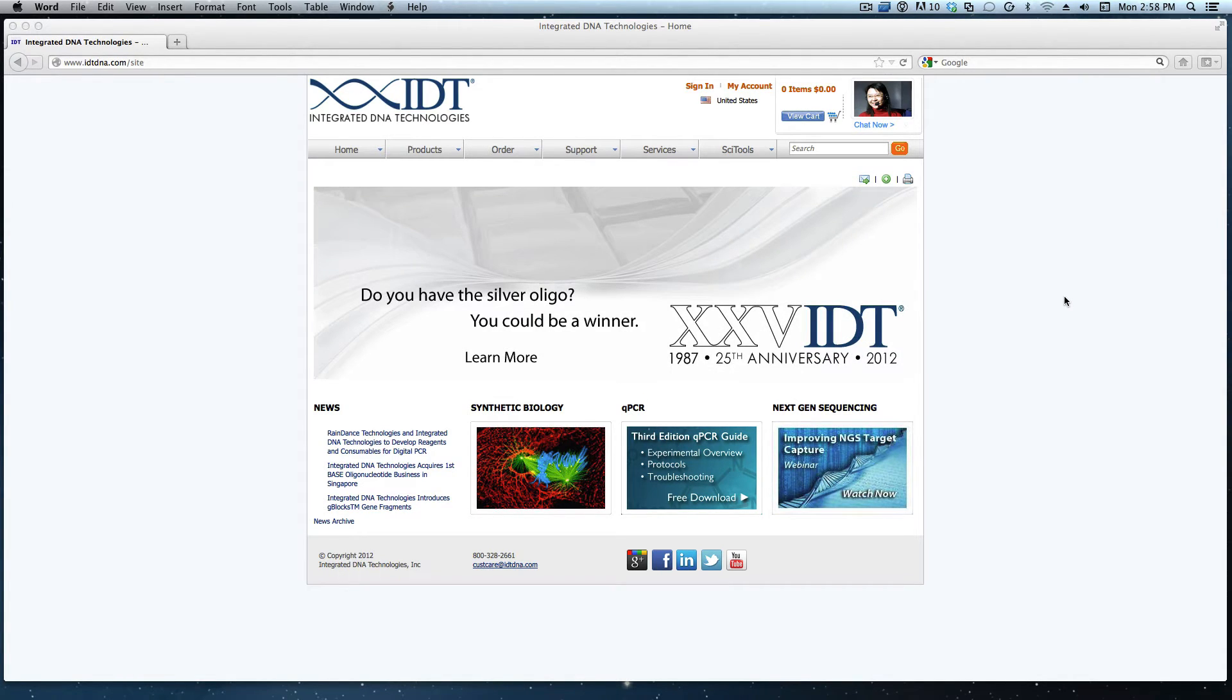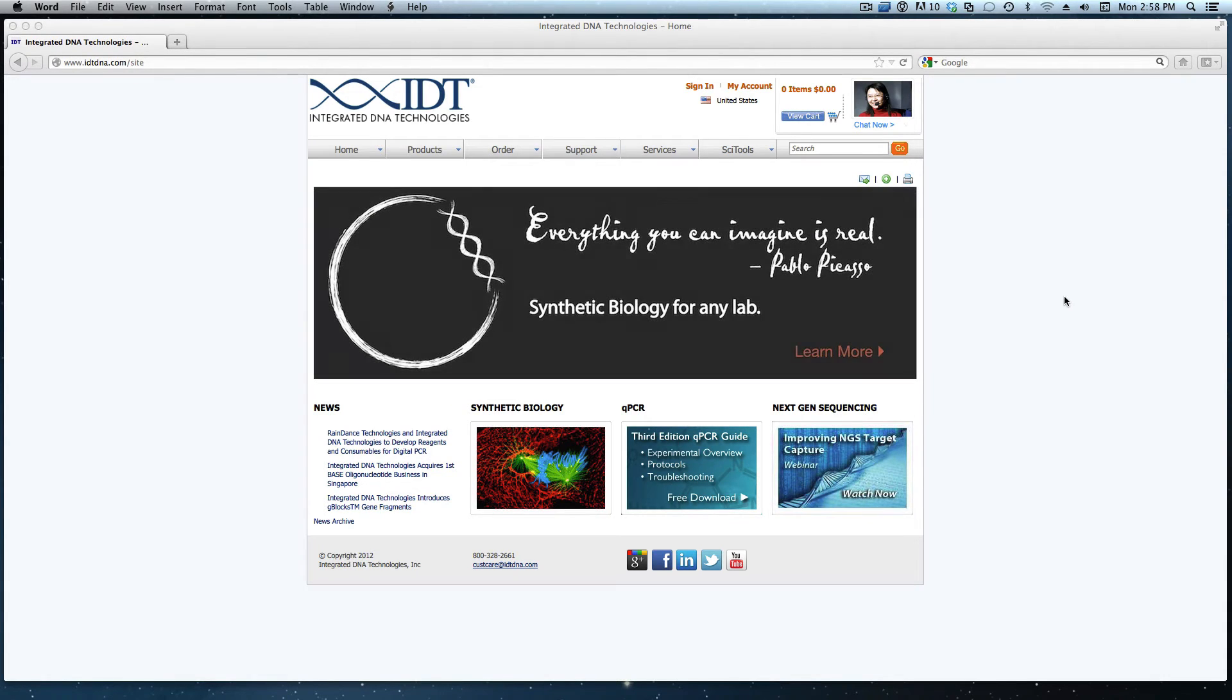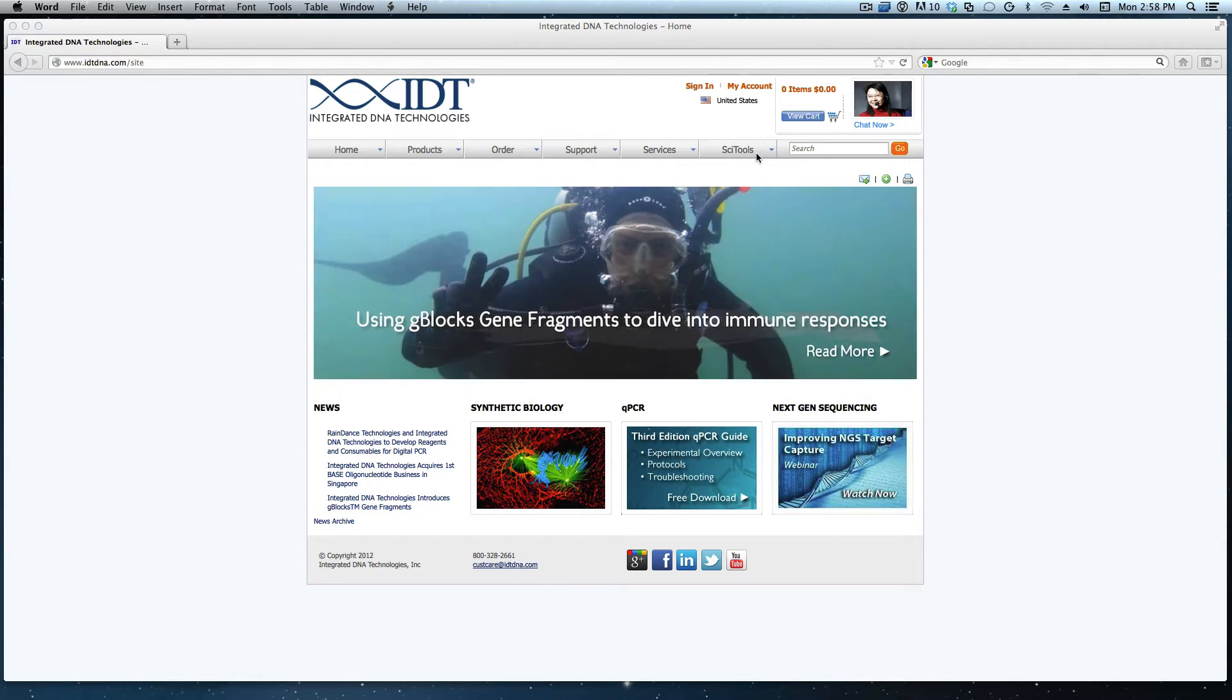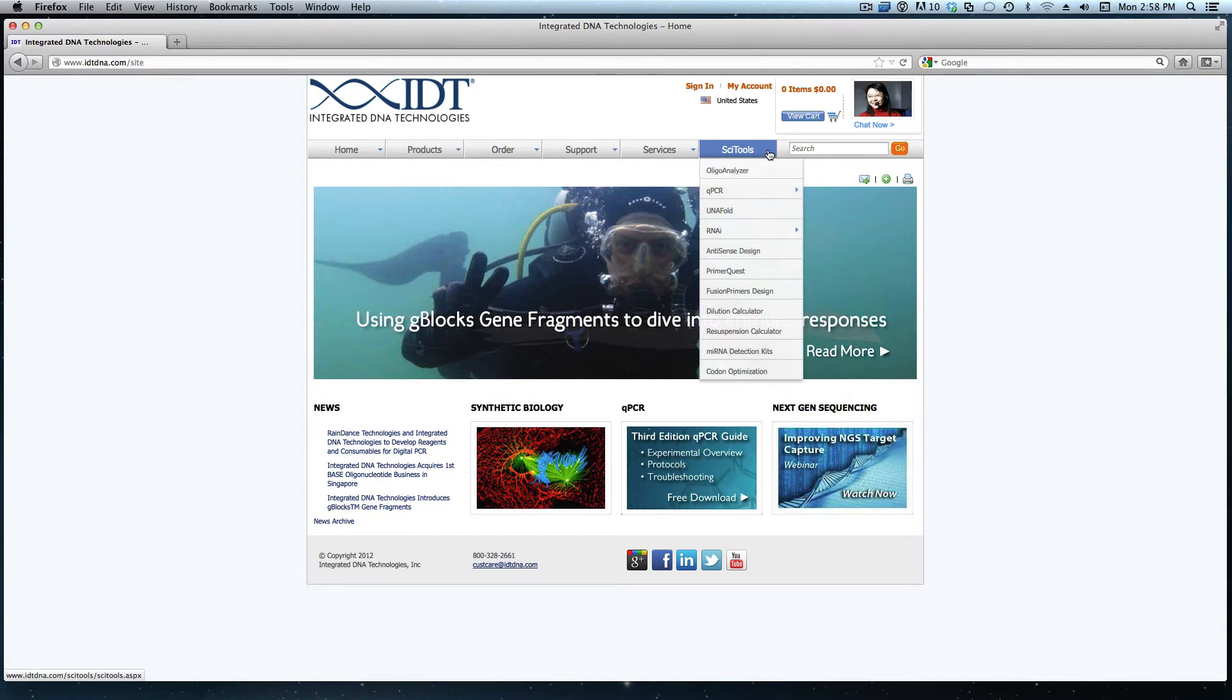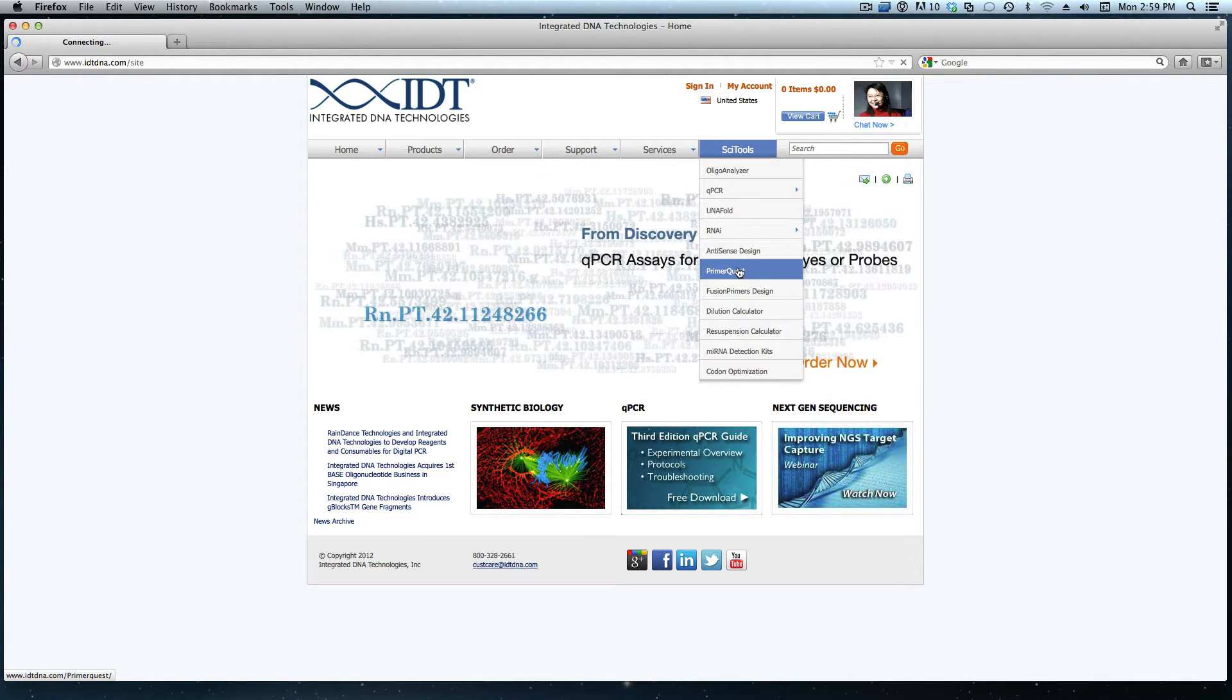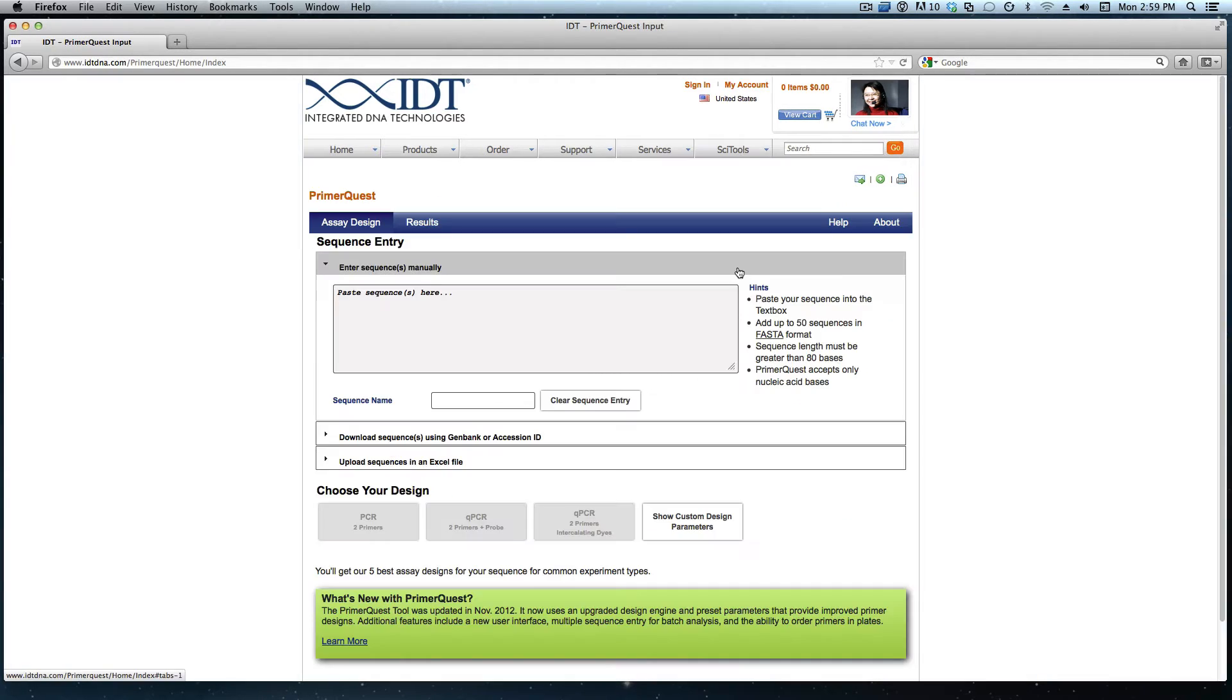PrimerQuest is the tool I will use as this tool allows for the most design customization. The first thing I need to do is pull up the PrimerQuest tool. This can be located from the SciTools drop-down and it's about halfway down that list. This drop-down is located on any page throughout our website.